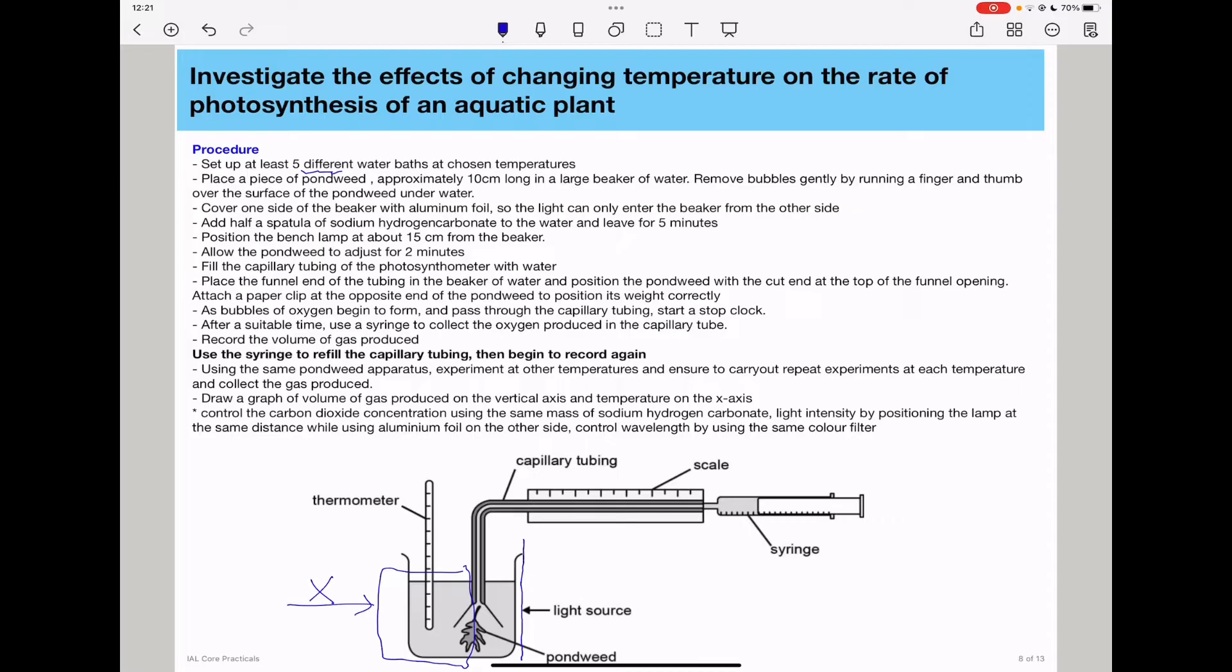You need to place a piece of pondweed, approximately 10 centimeters long, in a large beaker of water and remove bubbles gently by running a finger and thumb over the surface of the pondweed underwater. Some people decide to cut the pondweed underwater to prevent bubbles from forming, because bubbles will interfere with your experimental results.